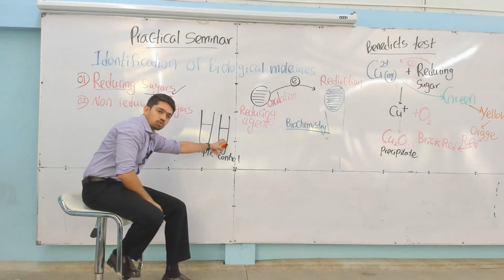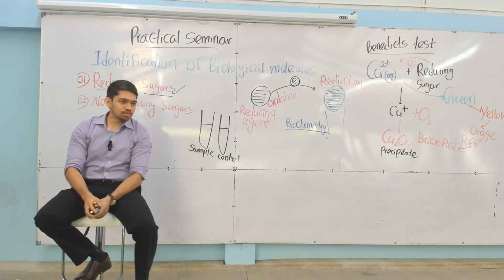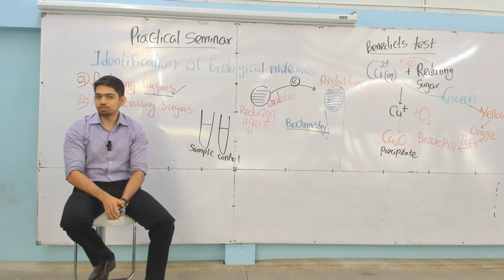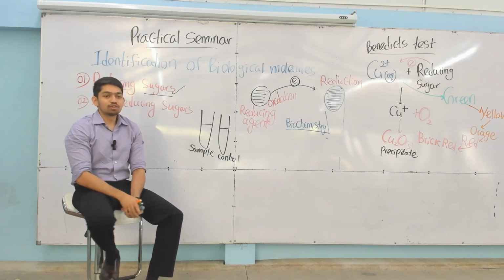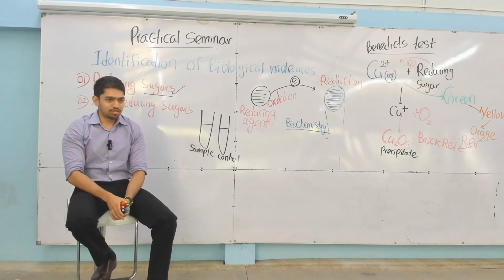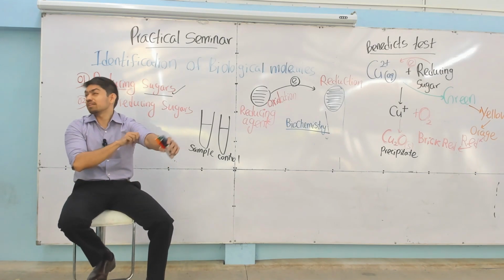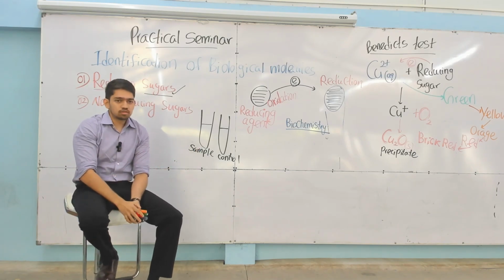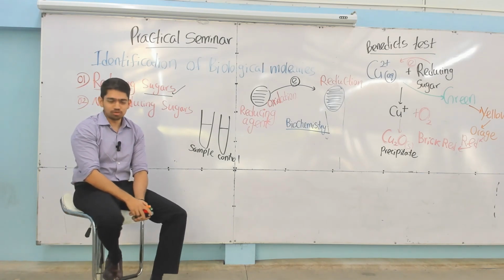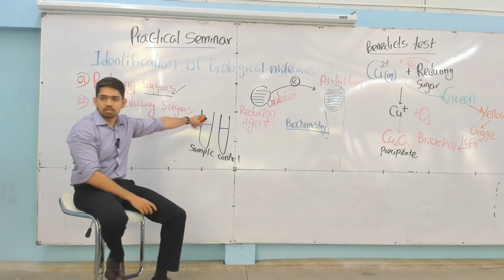Then the control. How do you obtain the control? Again, a normal urine. On the morning of the practical, all the boys in the batch should go to the Department of Biochemistry to donate urine, to use as the control experiment. Now, we have only about 180 in the batch, and only about 65 are boys. All the others are girls. So there's a limited amount of urine that we can donate. For one person, at least 20 to 25 milliliters of urine.